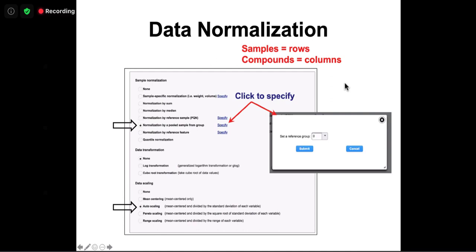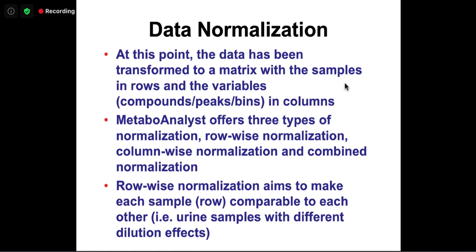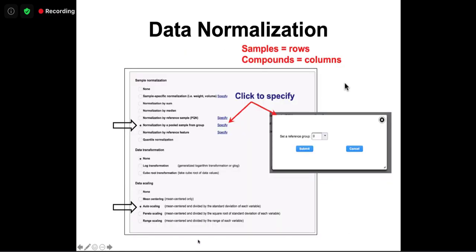So, I know some of you are asking the question, why do you choose that? This is just for demonstration purposes. You can certainly choose the other ones, but below here they give you some visualization that allows you to see whether the data looks normalized or not. A lot of times, based on your experimental design and the practice of this particular field, people usually apply certain methods. So you need to follow the standard before you try something that's not.